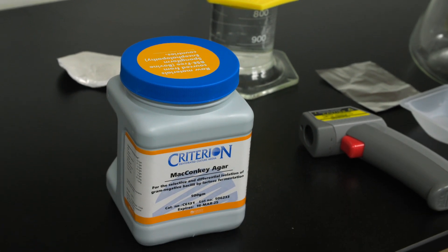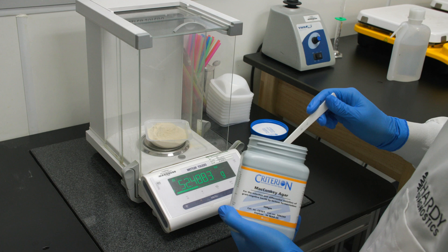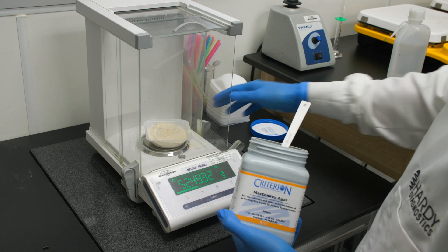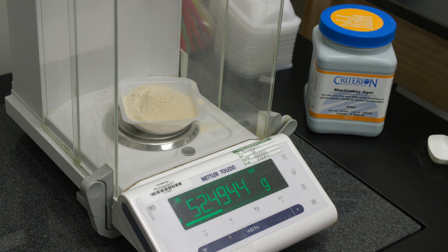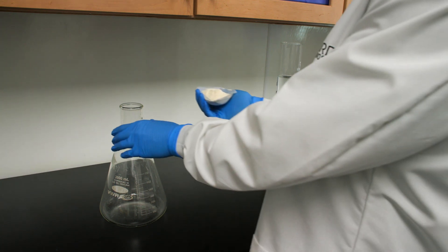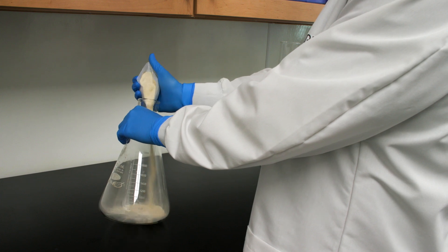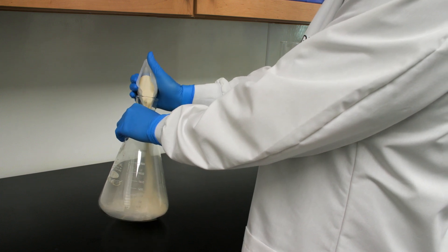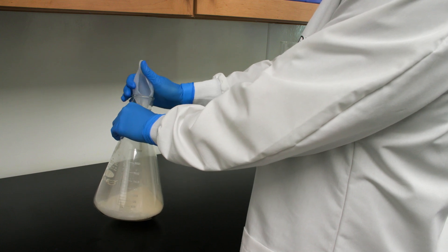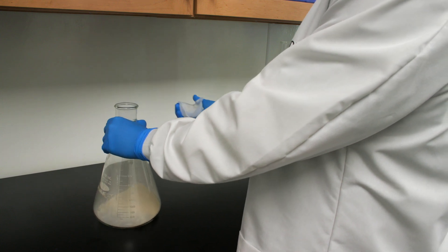Start by weighing the appropriate amount of dehydrated culture media for your batch into the weigh boat. To make one liter of MacConkey agar, select a flask that has a capacity two to three times larger than the volume you will be making — for example, if making one liter, use a two or three liter flask. Transfer the weighed dehydrated culture media into a clean flask.